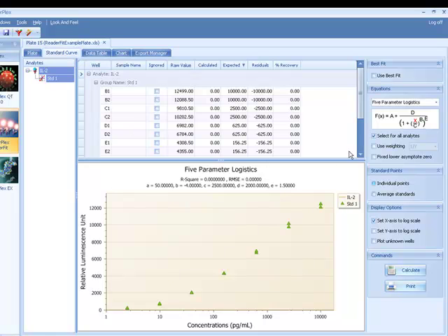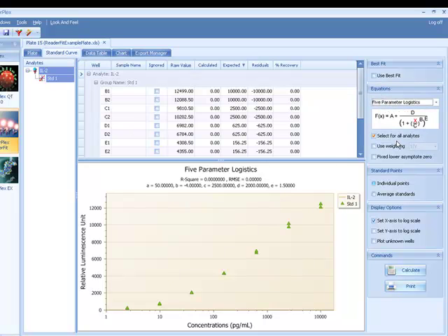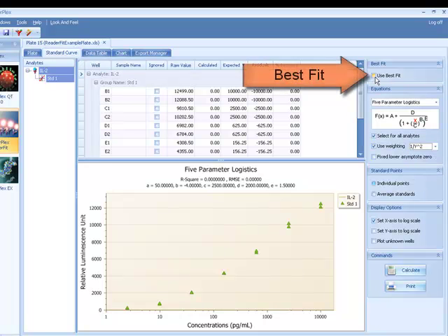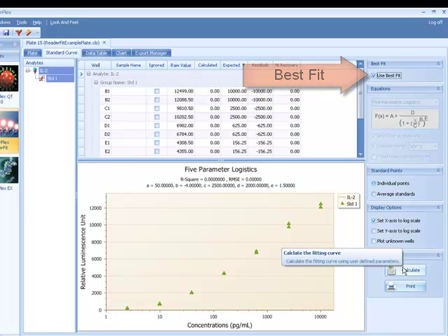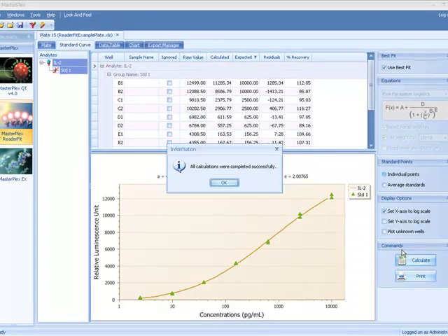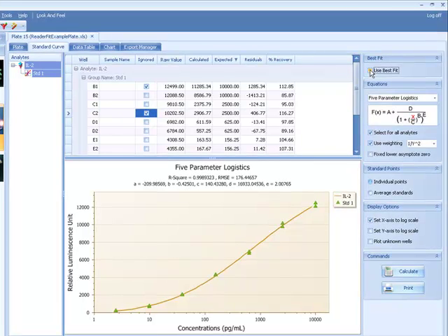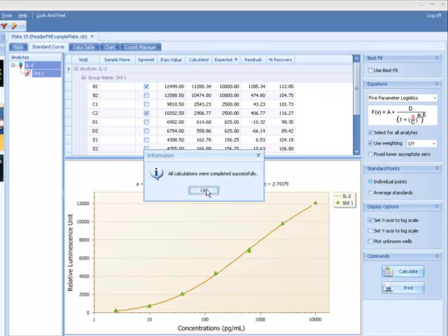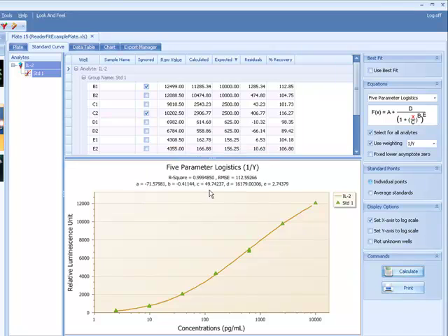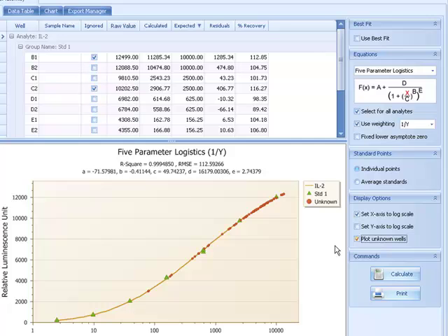Choose your preferred model equation and weighting algorithm, or use the best fit feature to have the software choose the best curve fit for you. Optimize curve fits by eliminating failed samples or apply different model equations on the fly. Plot unknowns and copy curve images.